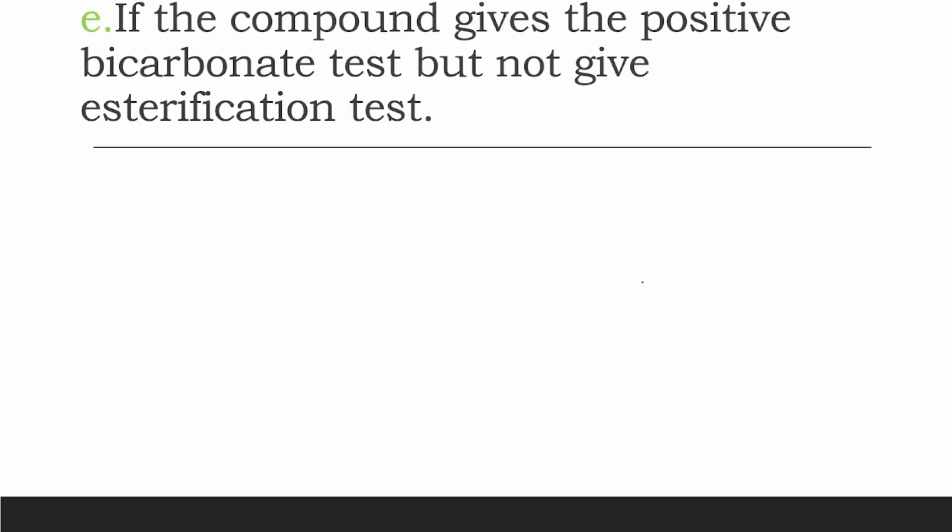Now, there are certain compounds which give a positive bicarbonate test but do not give the esterification test. Basically it has two possible reasons.